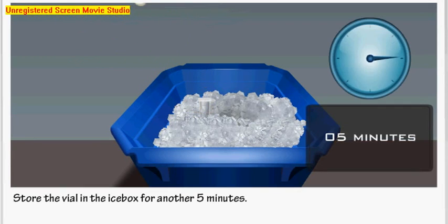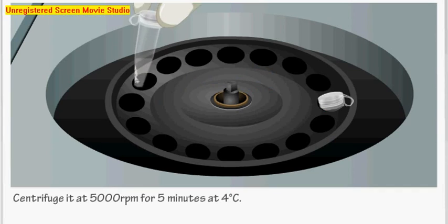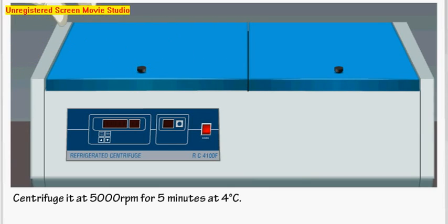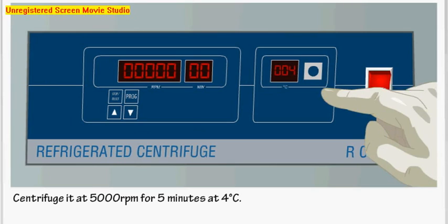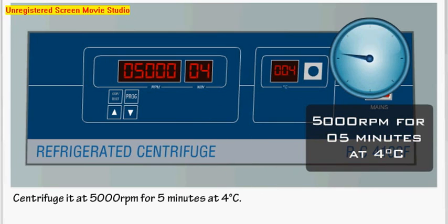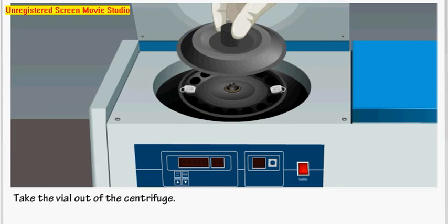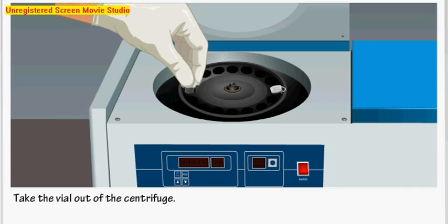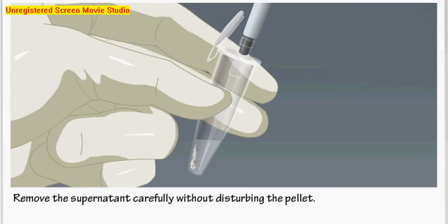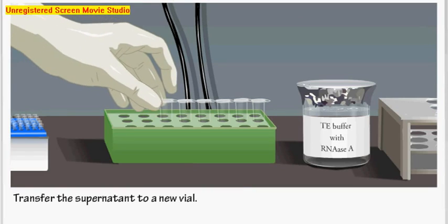Then take the vial and centrifuge it at 5000 rpm for 5 minutes at 4 degrees Celsius. Take the vial out of the centrifuge. Remove the supernatant carefully without disturbing the pellet. Put the vial back in the rack and transfer the supernatant to a new vial. We need the supernatant from now on — we don't need the pellet anymore.